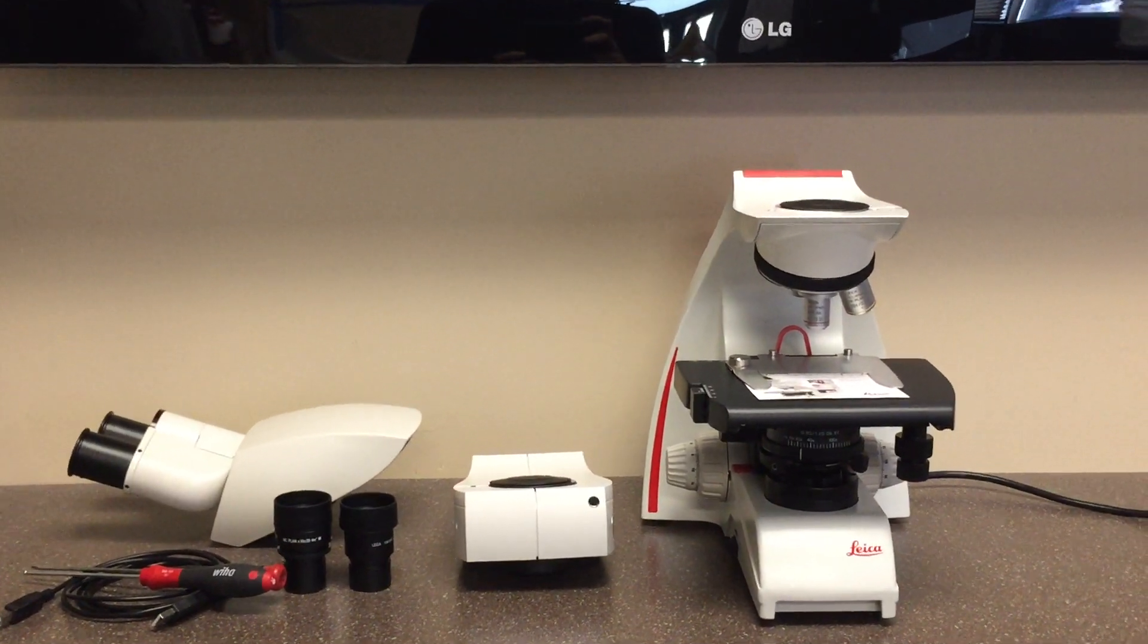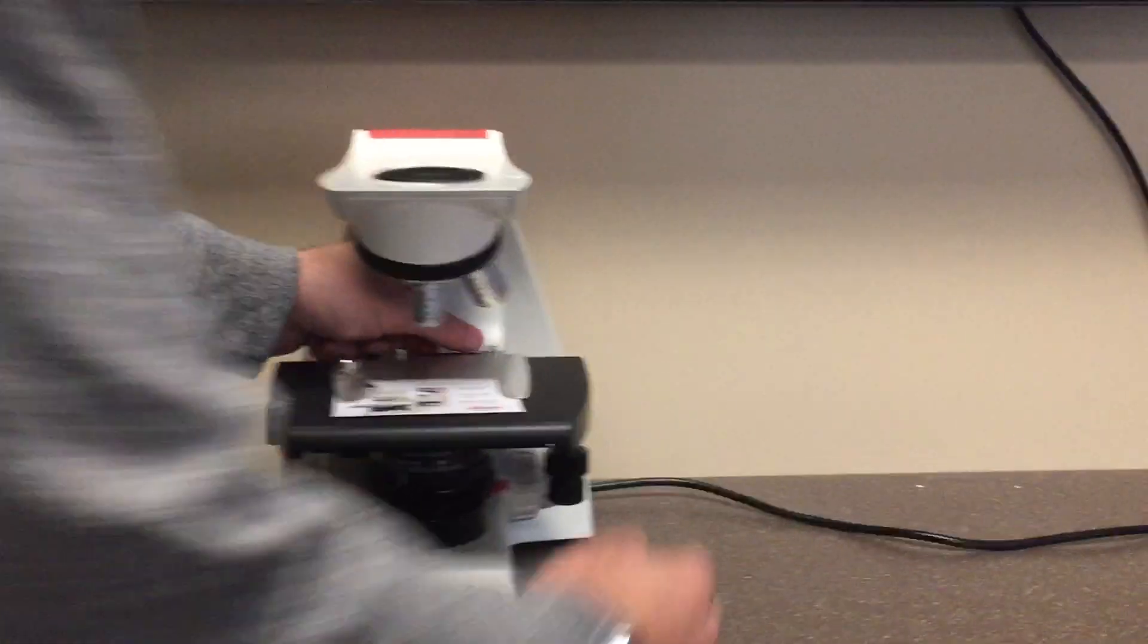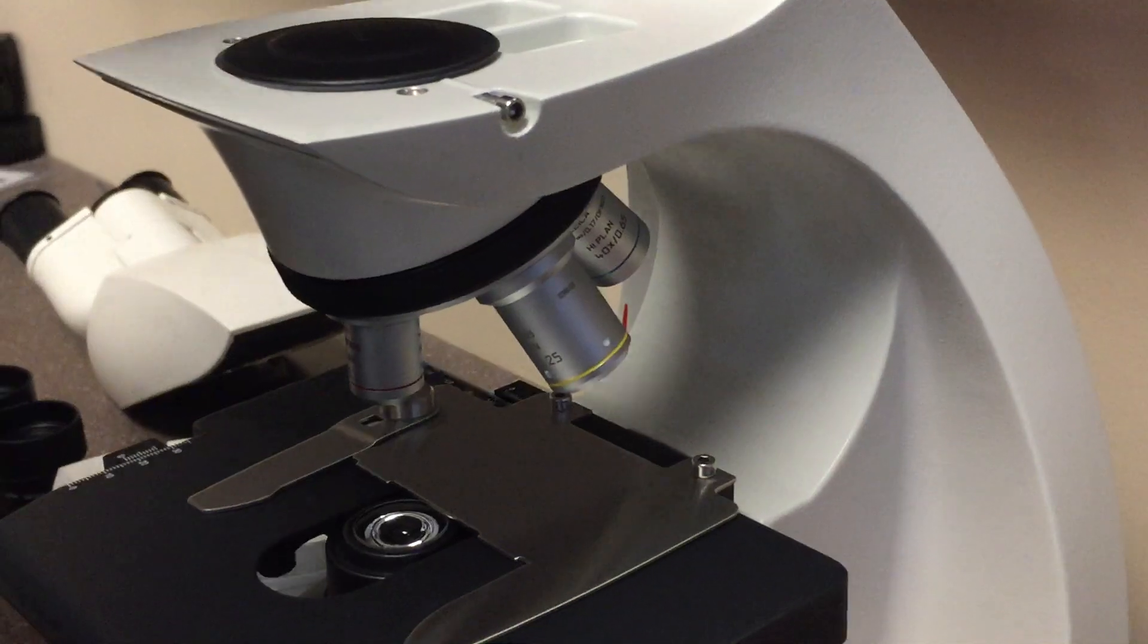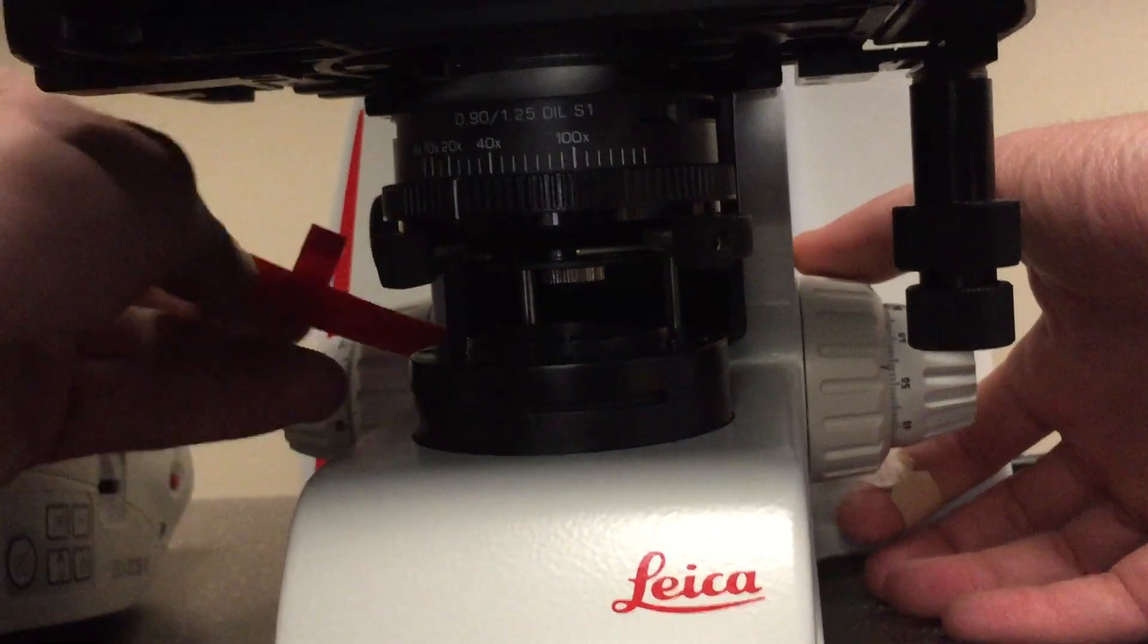First step is removing the shipping lock mechanisms from the microscope. You'll remove the top bar, remove the instruction sheet, focus up the microscope, then remove the bottom support.